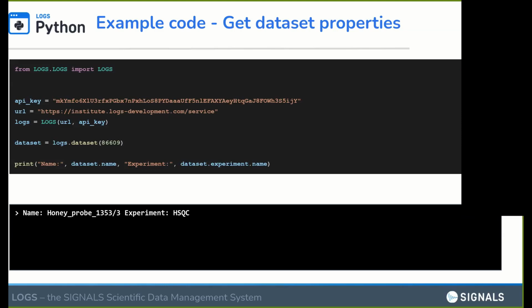I know not all of you are familiar with Python coding or are coders of Python, so please bear with me. I'm daring now to show also code in such a talk, but I think you will also see that using this interface to interact with your data is quite easy, even if you are not much familiar with programming here. I want to show you this code here.